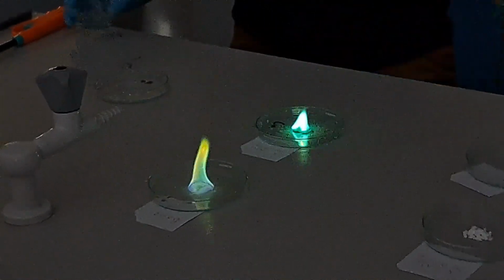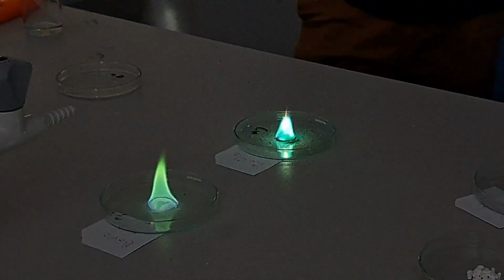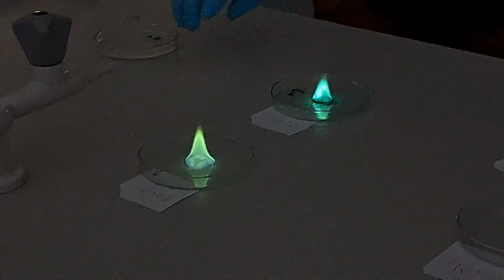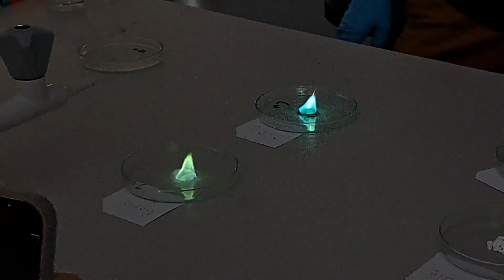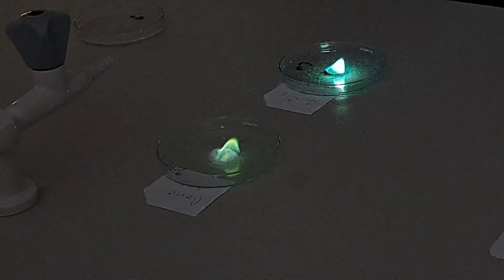Oh my god, that's rainbow. It's different shades of green. This is copper chloride. That is boric acid, with boron as an element. It's very flashy. I love copper, it has flashes.